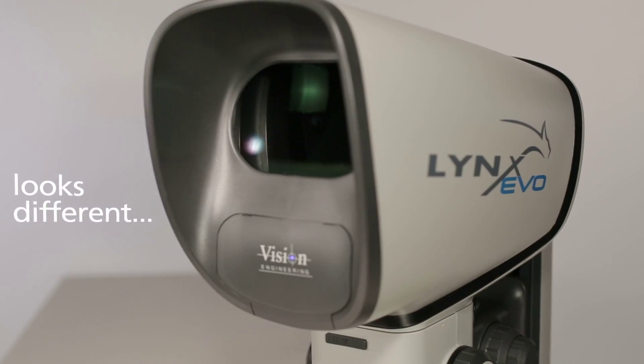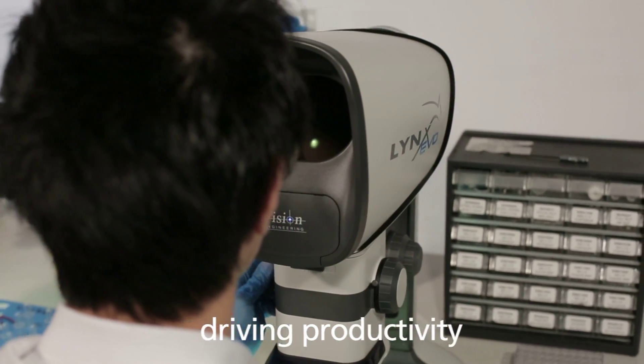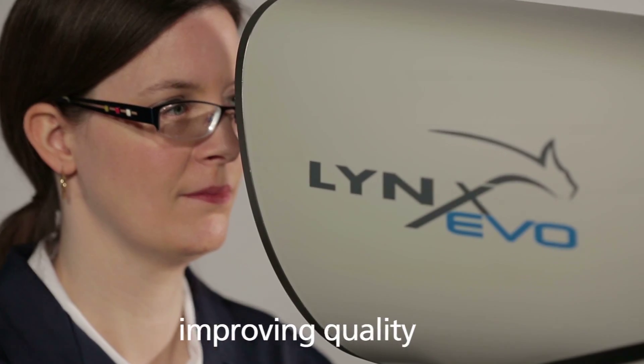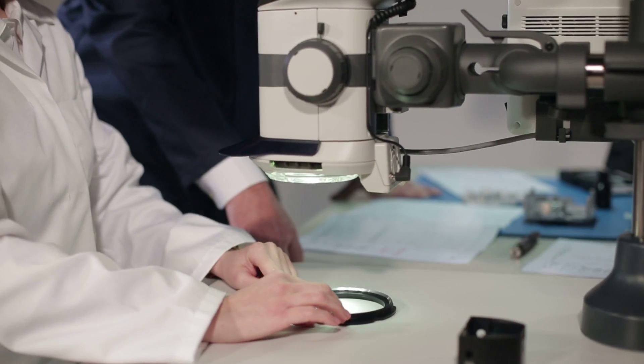Lynx Evo looks different, but also makes a real difference to your business, driving productivity, improving quality, making precision inspection tasks easy.